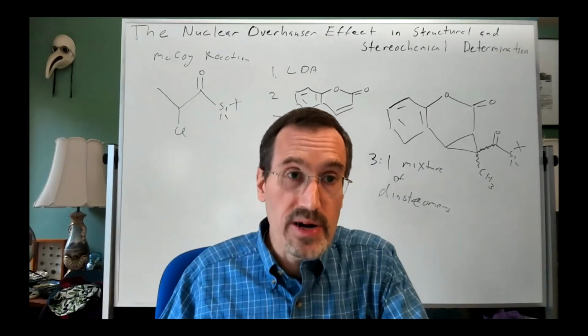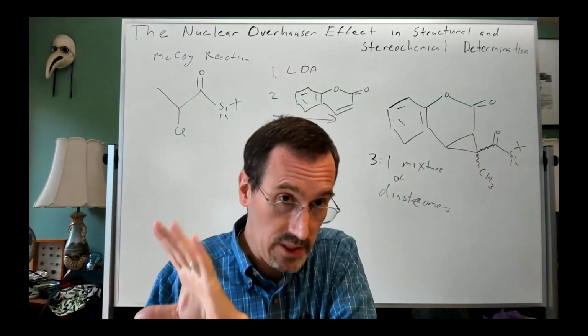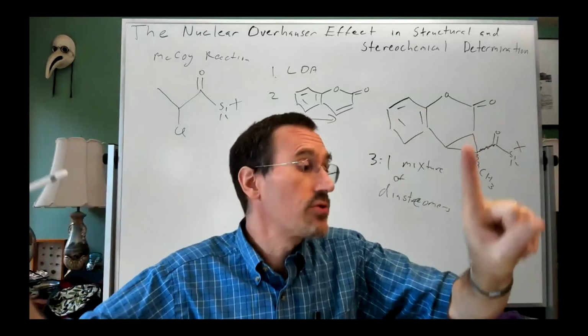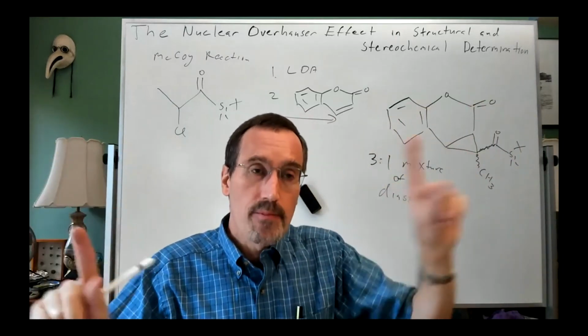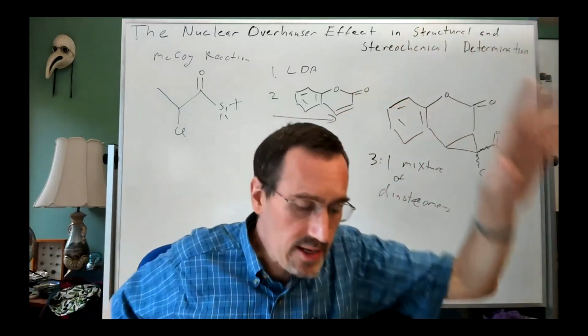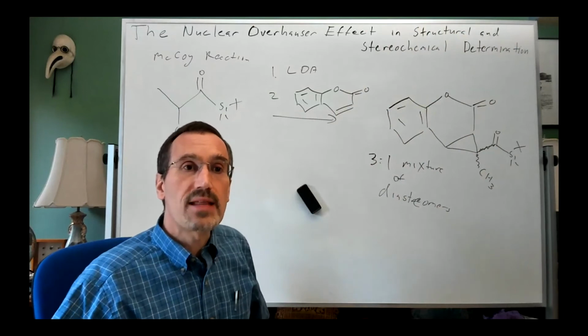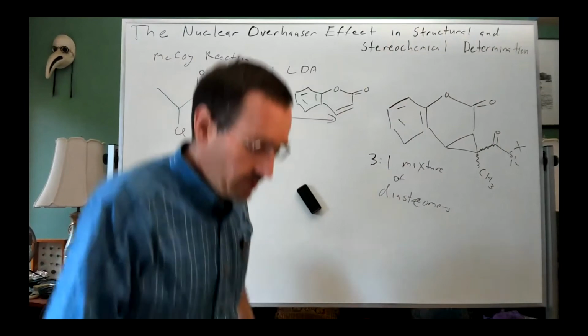And then the corroborating evidence in isomer B, the first NOESY we looked at, was those two highly anisotropic methyl groups, which are being separated by the ring current of the aromatic system. So those methyl groups are having a big degree of magnetic anisotropy.